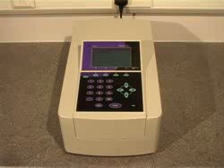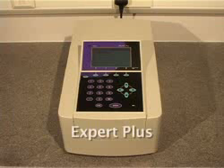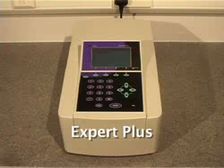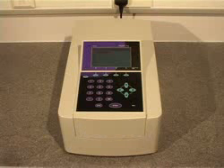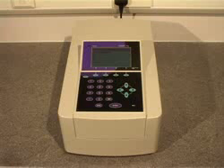The Expert Plus is a filter-based absorbance microplate reader manufactured by Biochrom in Cambridge. Using a multi-channel optical system, a 96-well plate can be read in under 10 seconds.